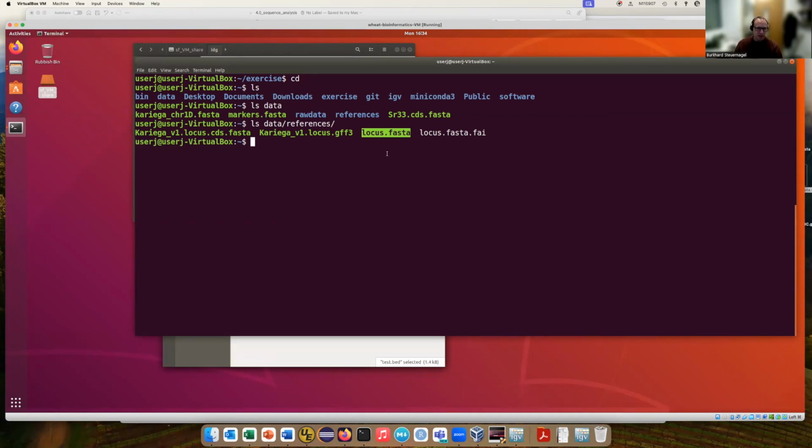And this basically is made for running fairly quickly for this exercise, and also to work in our virtual machine. If you have extensive computational resources, please feel free to download the original data and use that with the original genome for all your mappings and your blasting.